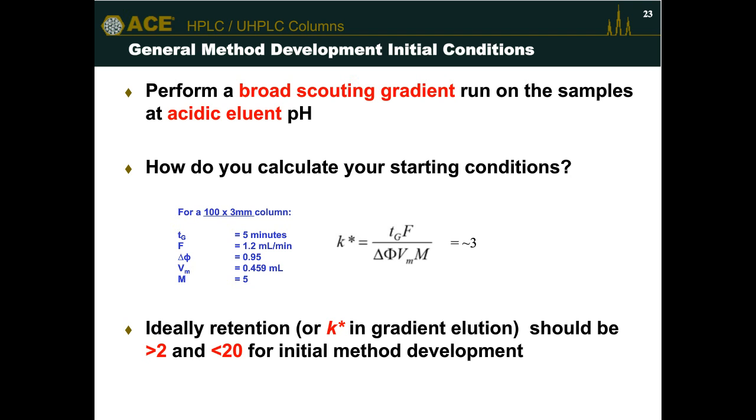So our approach for solid core technology has been to use a C18 base phase at low, mid, and high pH, and an alkyl aromatic phase, the phenyl hexyl, at low, mid, and high pH. So you're using pH as your selectivity tuner along with solvents and 2 column chemistries. So we don't have all of those chemistries on the solid core platform.